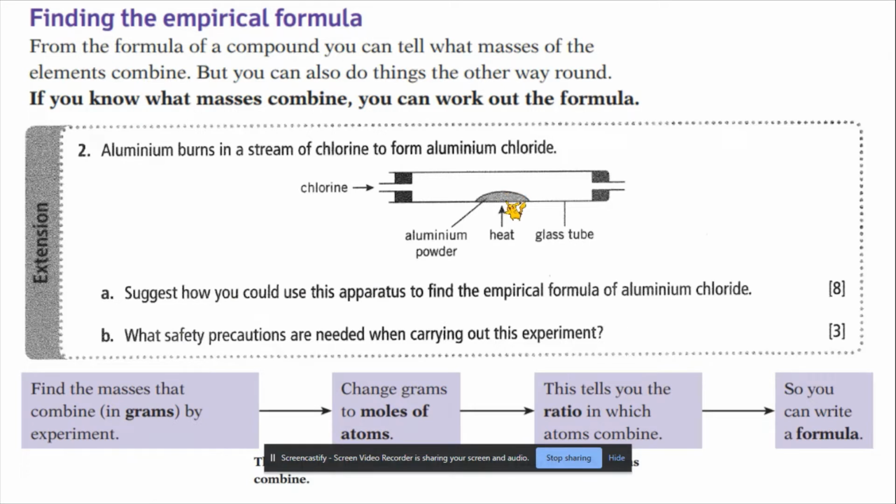I'm going to show you some video excerpts of this experiment that I've located, thanks to Cardiff University for the work that they've done in filming that, and that was supported by SEP and RSC. So I will be showing you some of those to make sense of this experiment. But in those videos, you actually use a roll of aluminium foil. It's actually convenient. So you can weigh your aluminium foil, figure out what its mass is in grams. You can then work out from that your starting number of moles of aluminium.